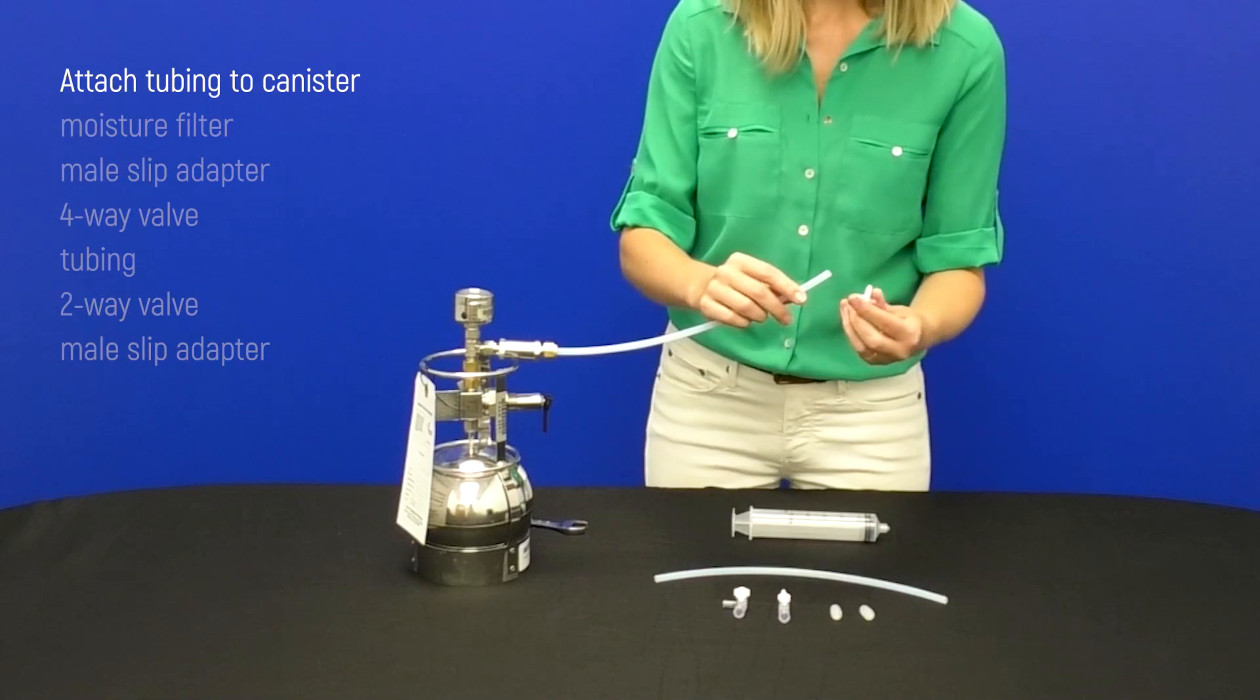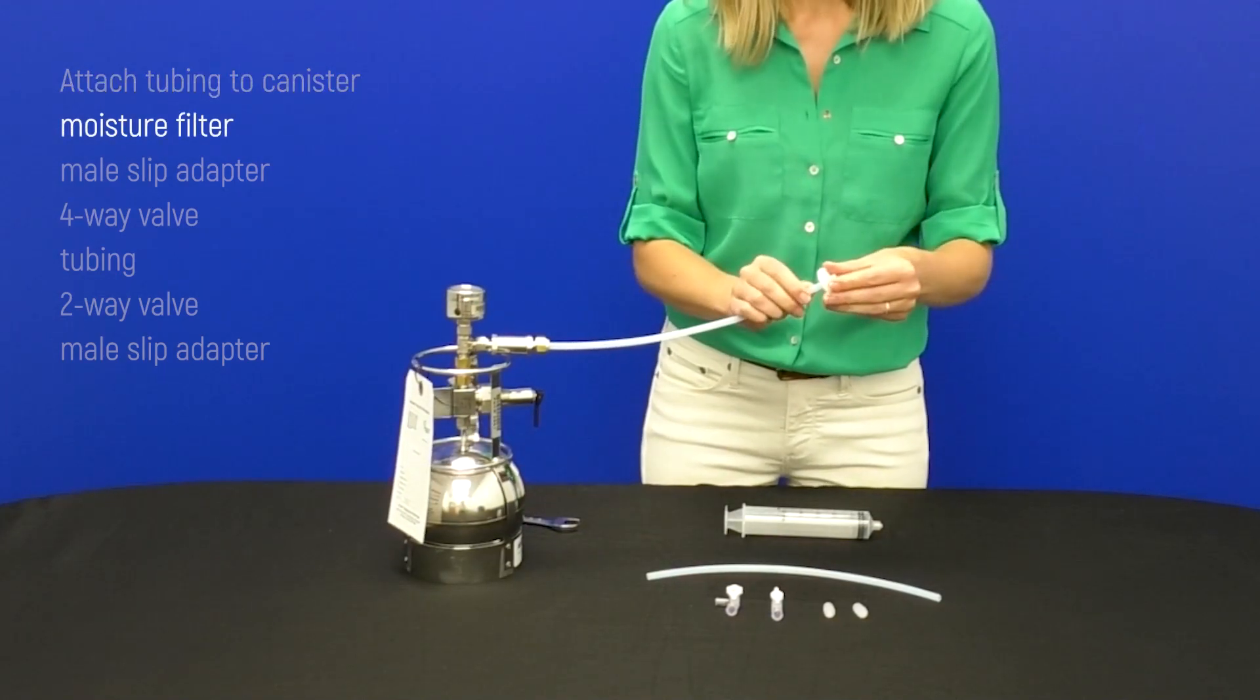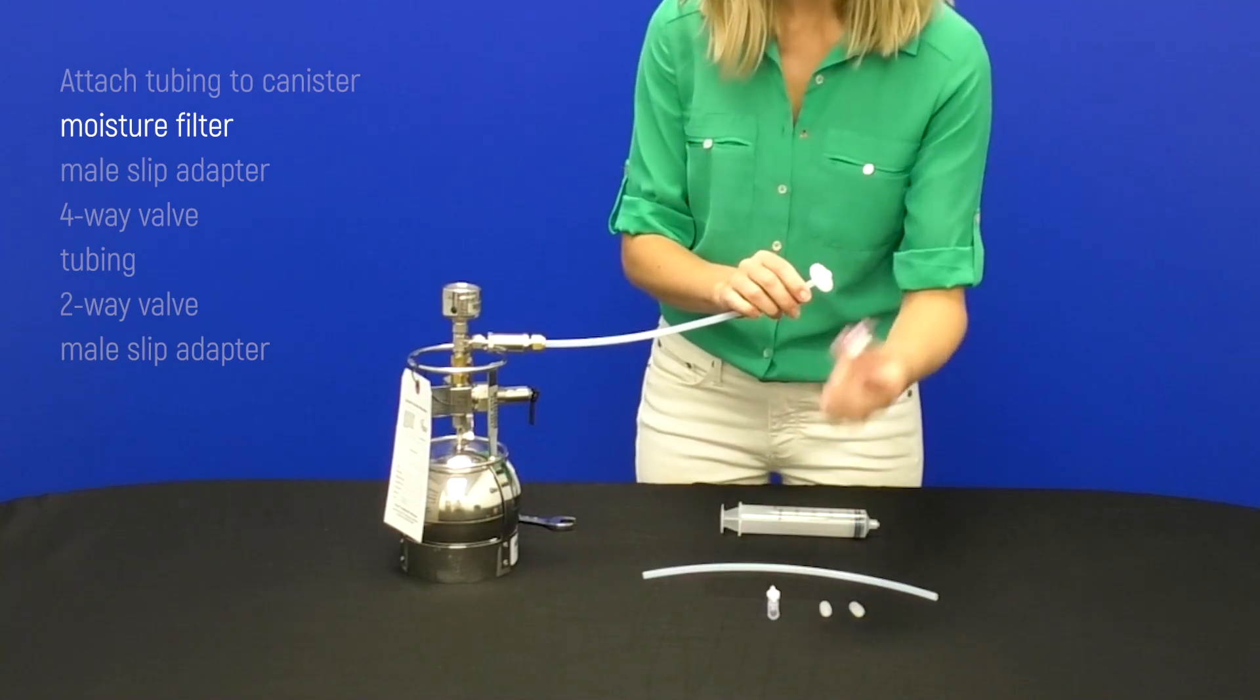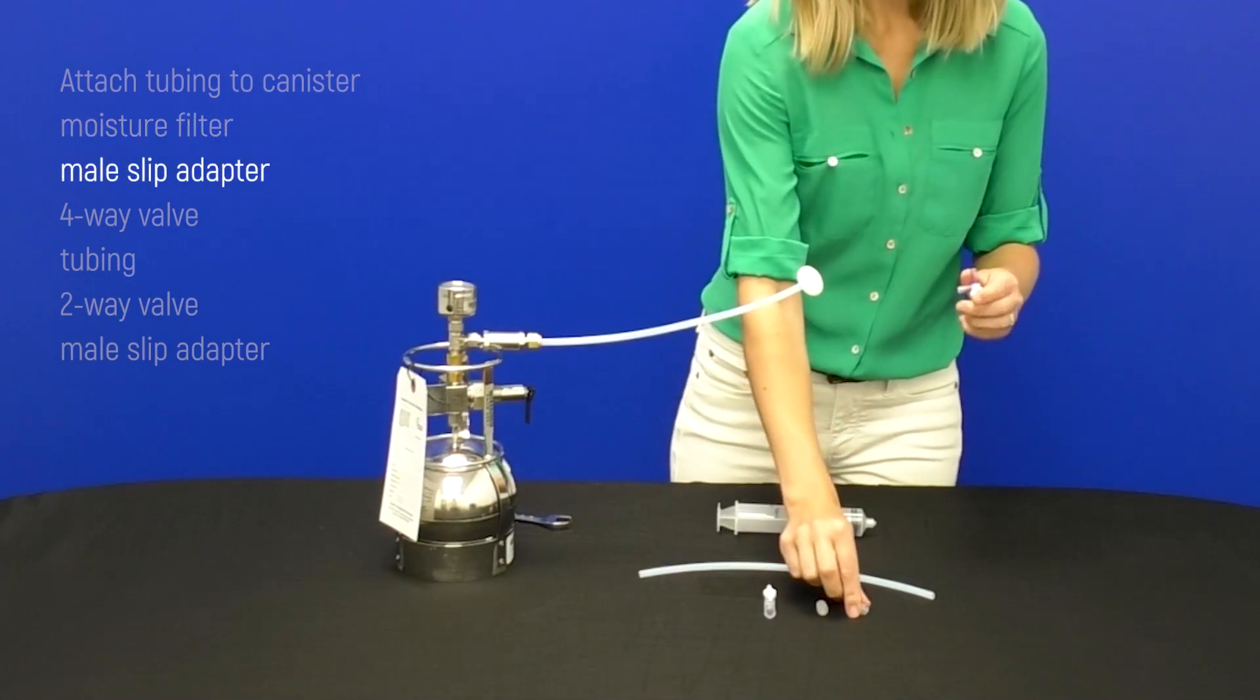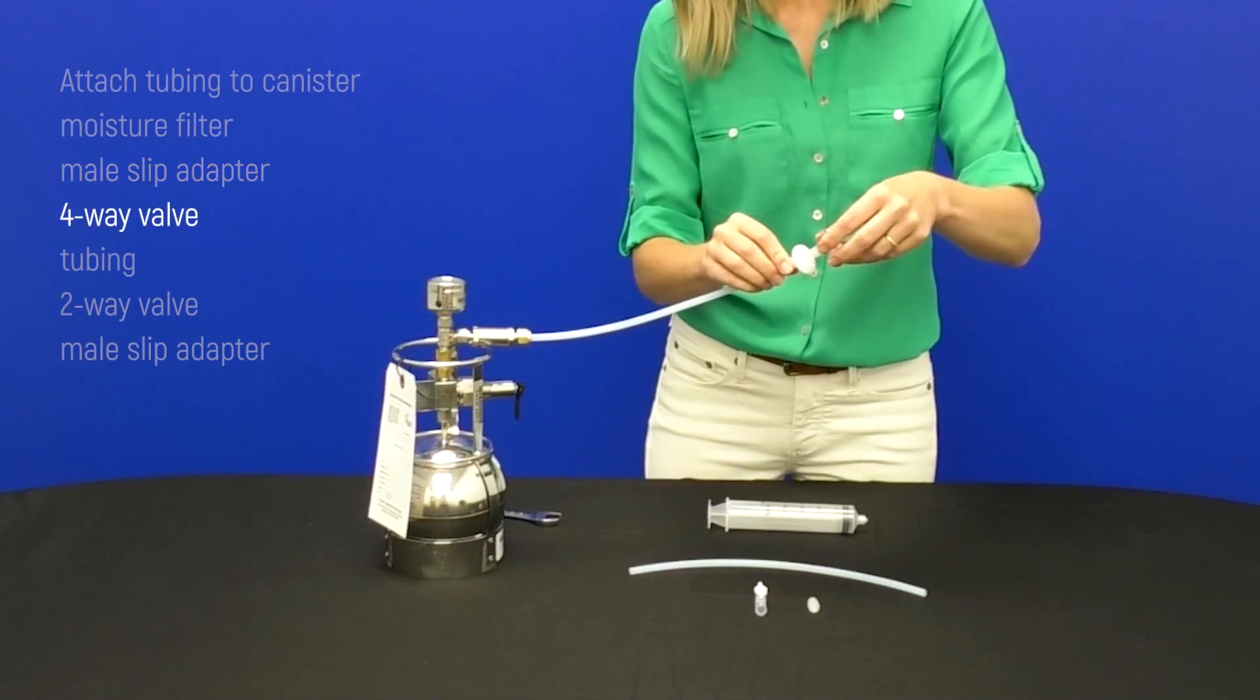Then from here, you will attach your moisture filter and then this will connect to the side of the four-way valve. So use one of the male slip adapters to connect that and the moisture filter.